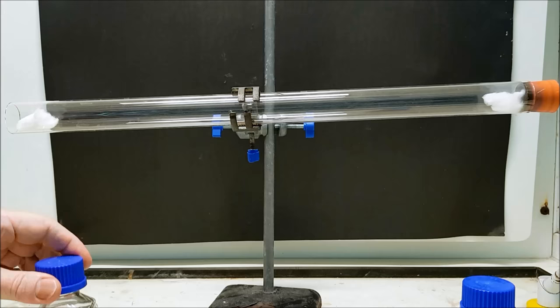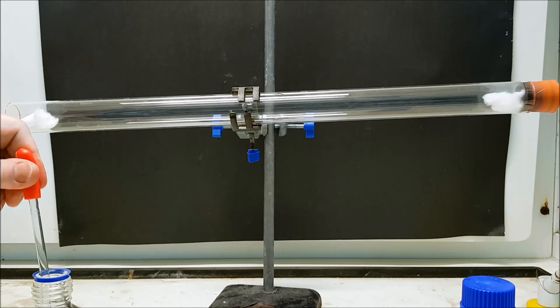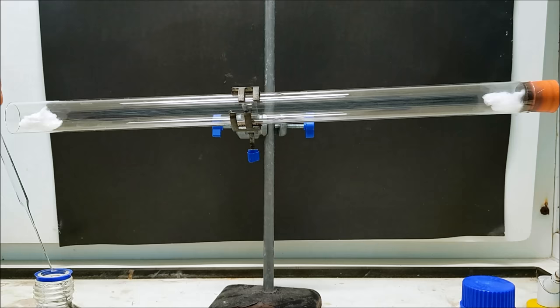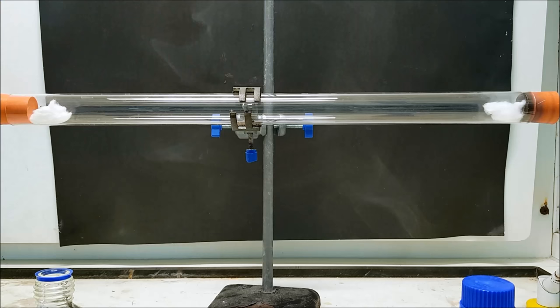Over on the left-hand side we've got some concentrated ammonia. Again, a milliliter or two. Close off the tube with the bung, make sure it's level and observe.